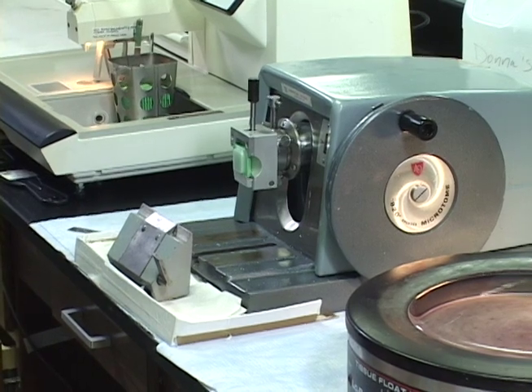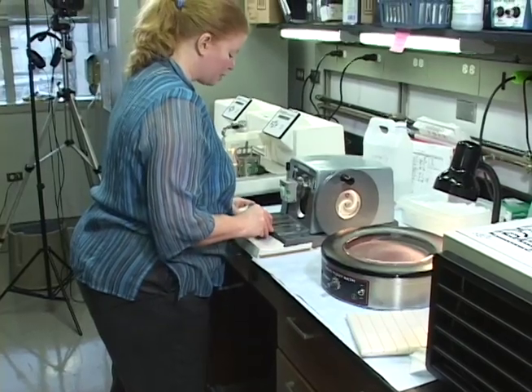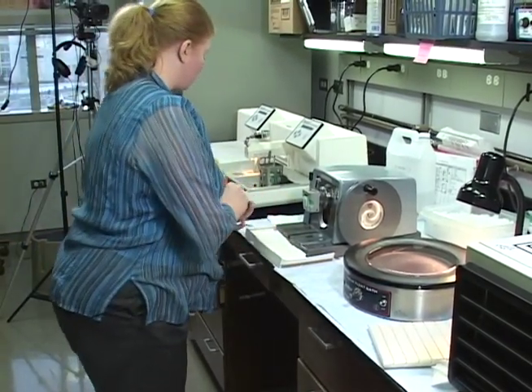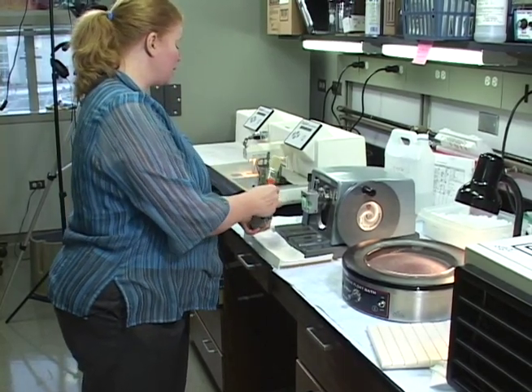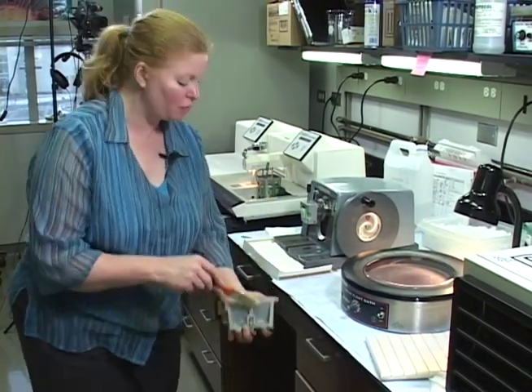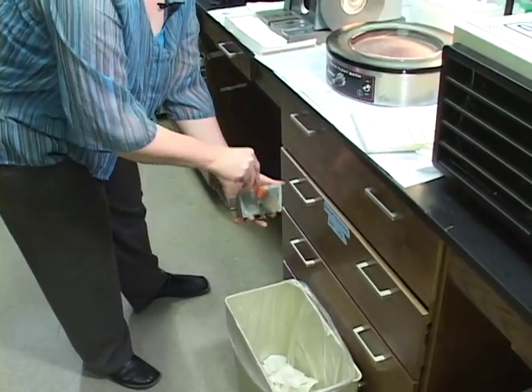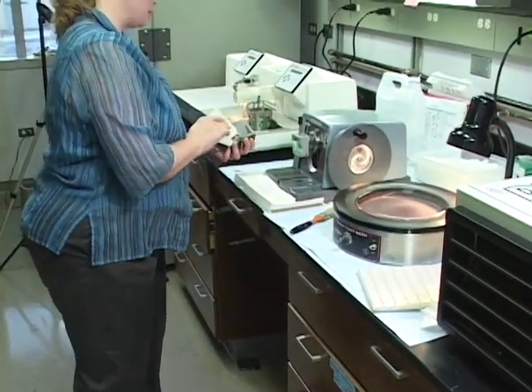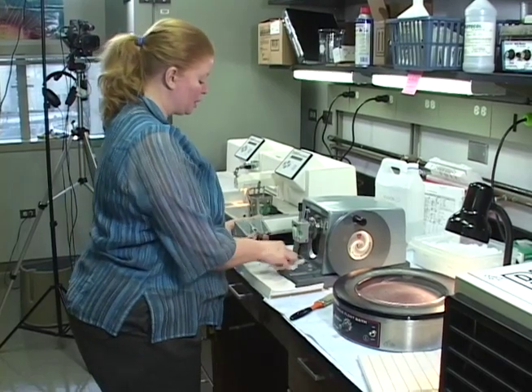And in here I have more gauze. So, I'll put this back on. Since we have it all out, we'll just give it a little brush. And don't drop this, whatever you do, because it is pretty calibrated, and a little ding here will make it simply not work and not clamp your knife good. Give it a little brush off while we've got it off. If somebody's got paraffin built up on the back of it, we'll just clean that off at the moment since I'm demonstrating this.